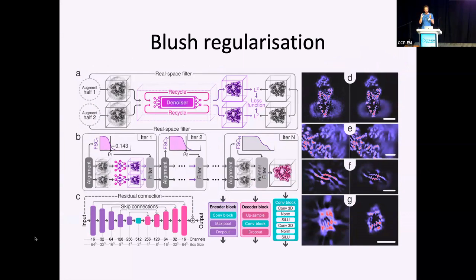And it's based on a noise-to-noise type of training of a neural network that we have trained on many different EMDB half maps. So this neural network has kind of learned something about signal and noise in EMDB maps. And importantly, there are no atomic models like PDB. There's no information from the PDB going in. This network has only been trained on half maps from the EMDB. Dari has implemented several quite clever tricks on how you can then let that network also focus on what to do with membrane patches and solvent regions, etc.